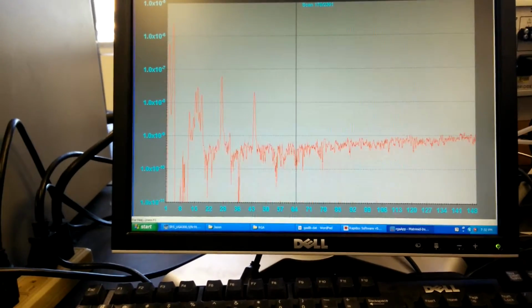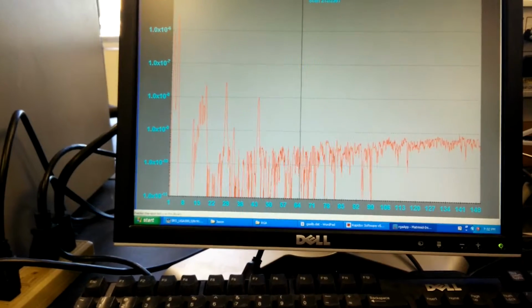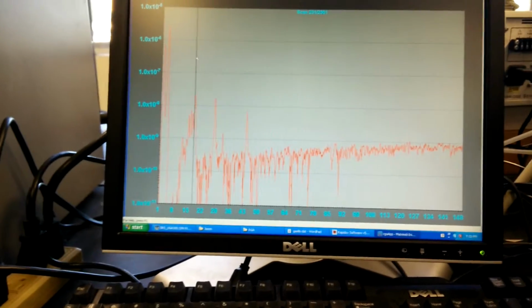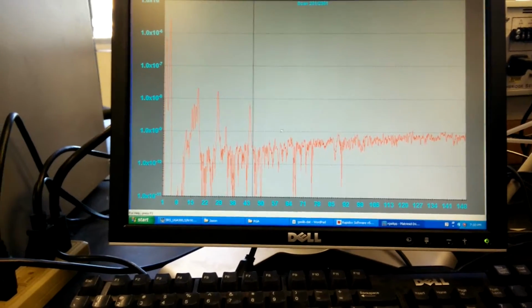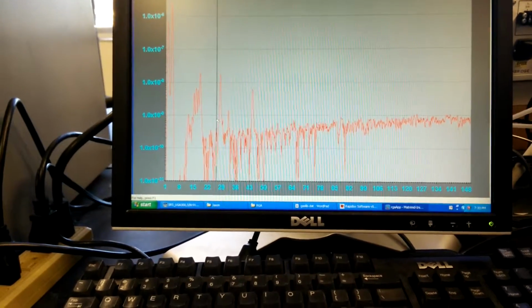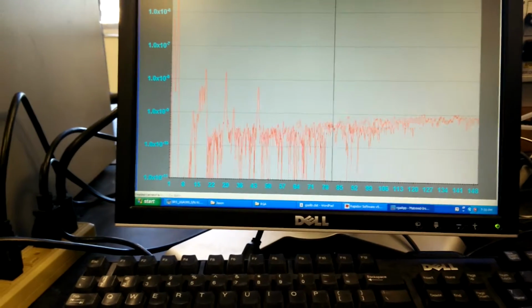So this is just growing and growing, but we've now reached the 550 degrees soak time. So now it is soaking at 550 degrees. We see some hydrogen that has formed. There's methane, water, CO2, CO, and oxygen, I think, at 32, and possibly a little bit of hydrogen cyanide at 27. Actually, it probably hasn't formed yet, so there's very little, if any.